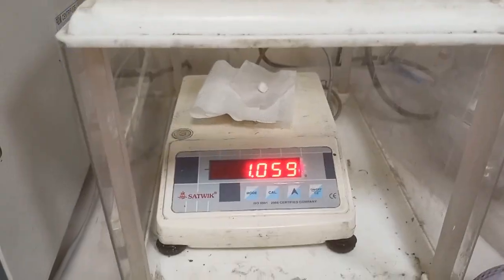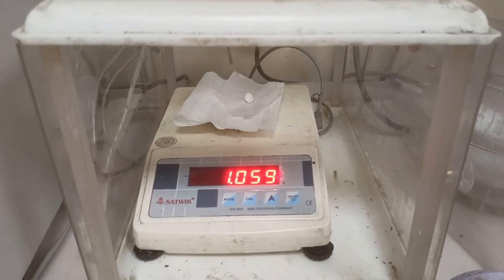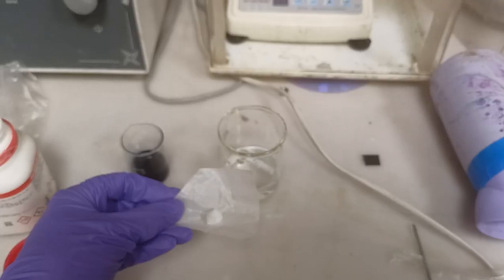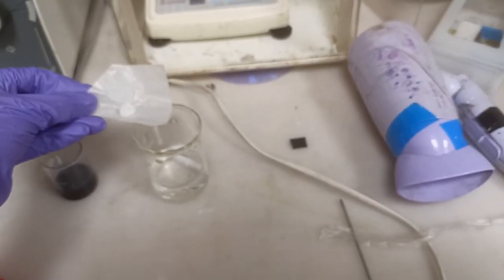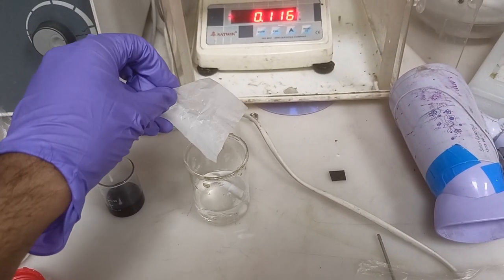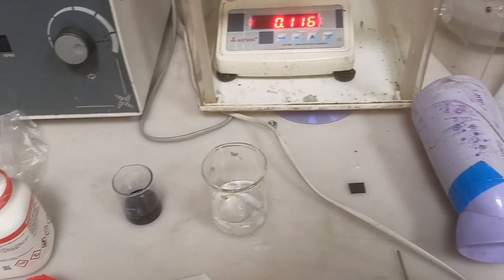We are going to take 1 gram of tin chloride. It is from Sigma Aldrich but you can use any other tin chloride, no issues. I am going to add 1 gram of tin chloride into this 40 ml of water and then stir it.